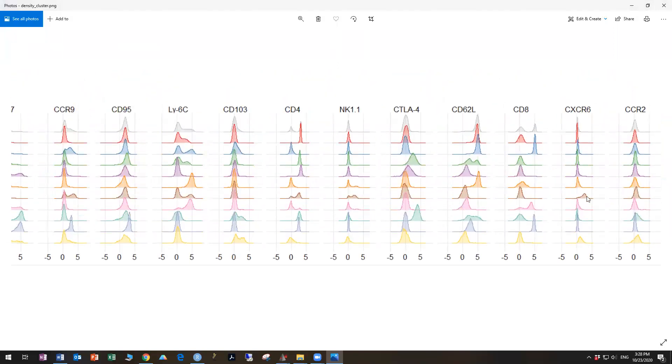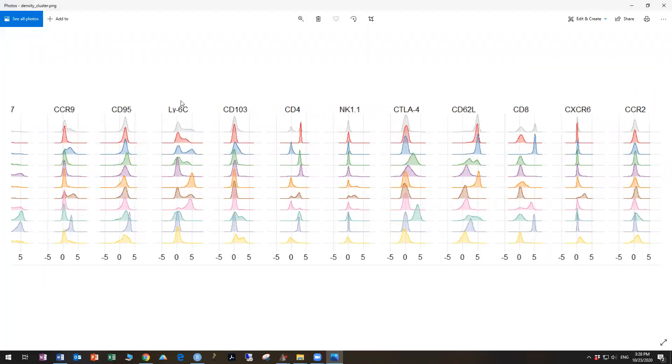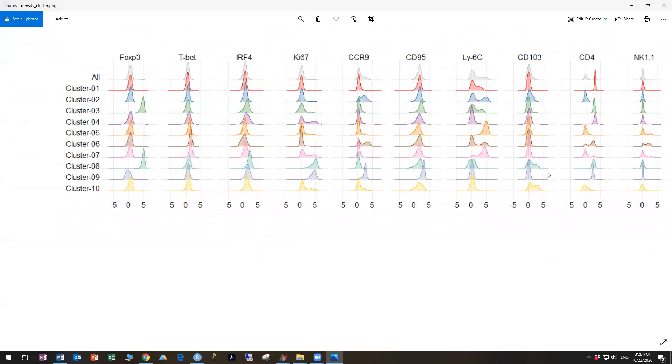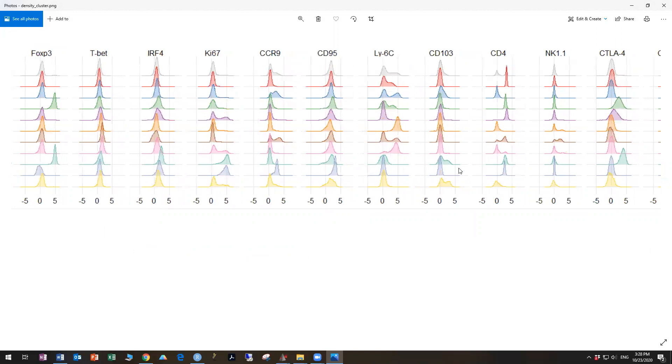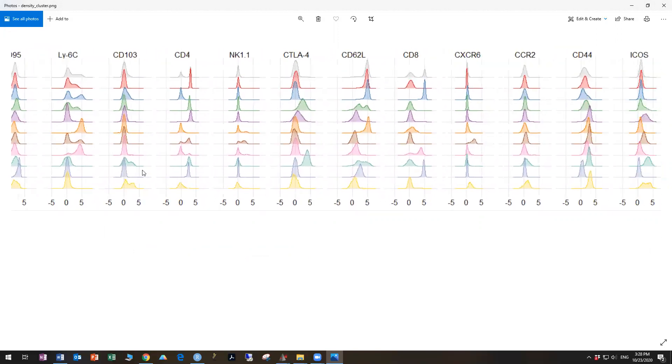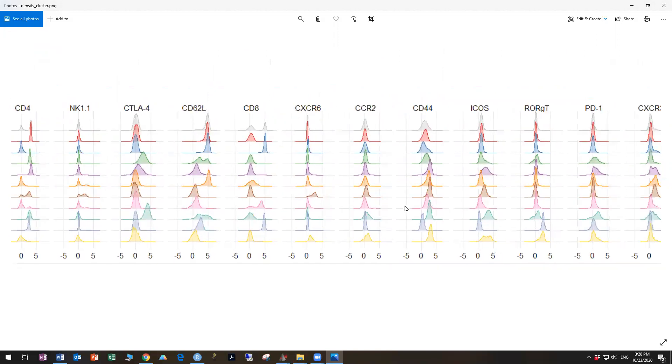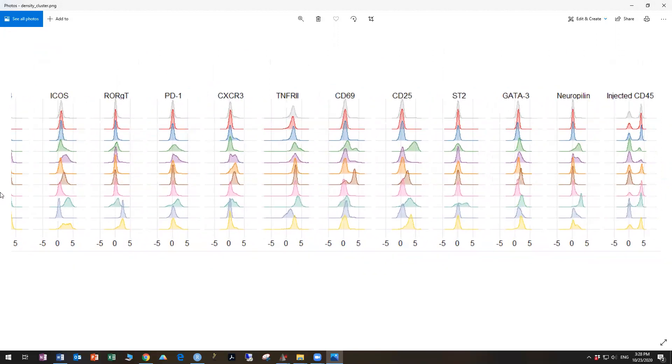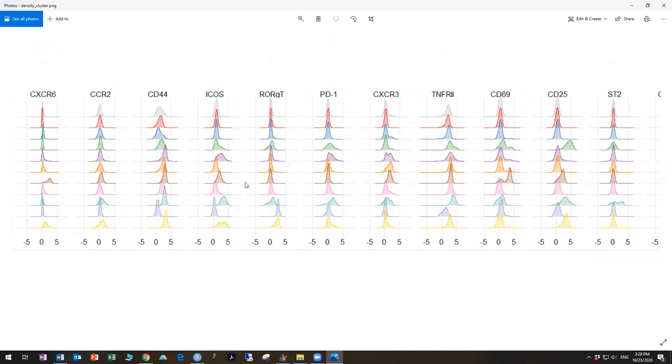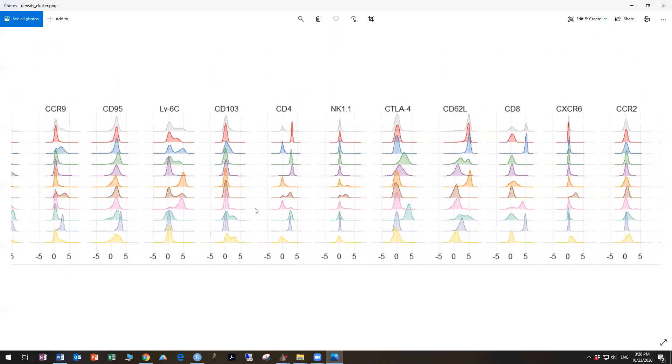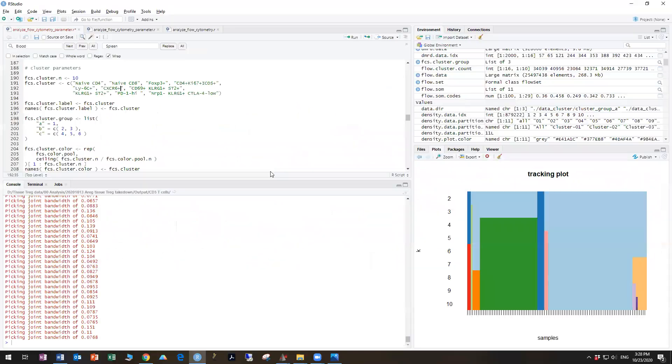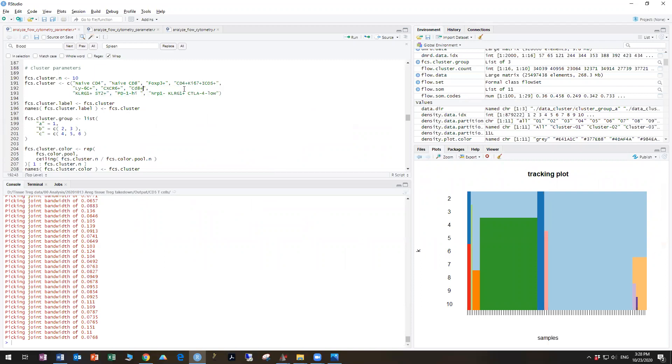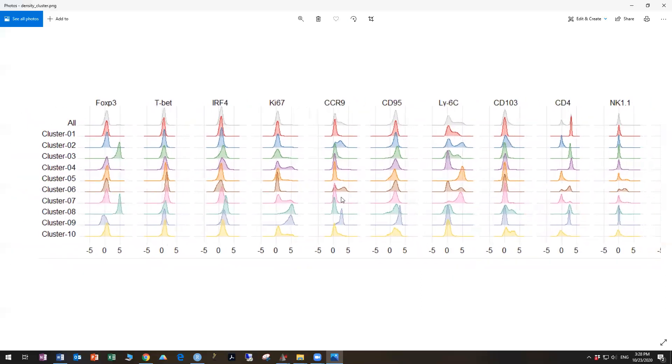So cluster six looks like it has CXCR6 on it, so let's call it that. Cluster seven. And CD8 positive and injected CD45 positive. And I do think you want to come up with a name that's unique for each one. And you want to keep the name relatively short so that it fits on your plots.